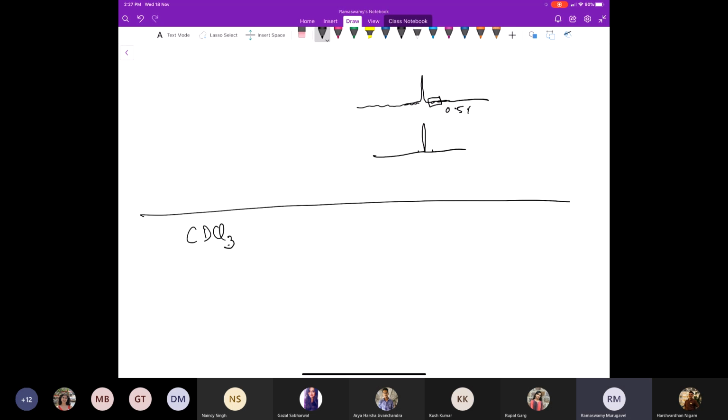Now, if you go to CDCl3, the proton NMR spectrum will not give anything, but you can do a deuterium NMR. It's of no interest to us. But when you do a 13C NMR of this compound, you have enriched 100% deuterium, so there is no proton at all. The 13C is only 1%, but all of these 1% of the molecules will have a deuterium associated with it. So 13C will always have deuterium and never a proton. As a result, the carbon should give one signal, and because deuterium is coupling with it, you will get this.